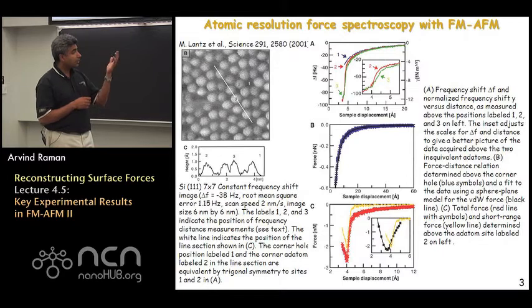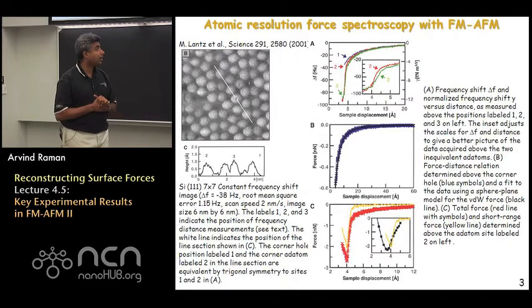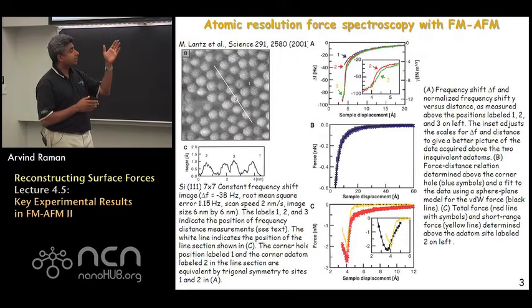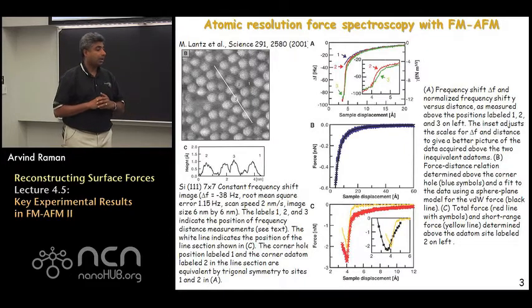And what was done with this study further was some quantitative estimates were made about the forces involved, using the kind of inversion reconstruction formulas that we've already talked about. What you see on the figure in the middle on the right is the reconstructed conservative force on the hole, or on the vacancy, if you will. One notices that the interaction force as you approach the sample has this attractive feature as it goes down.